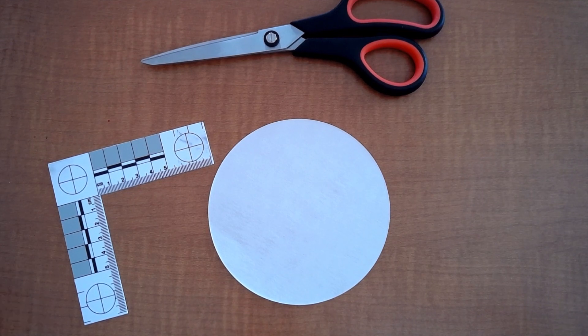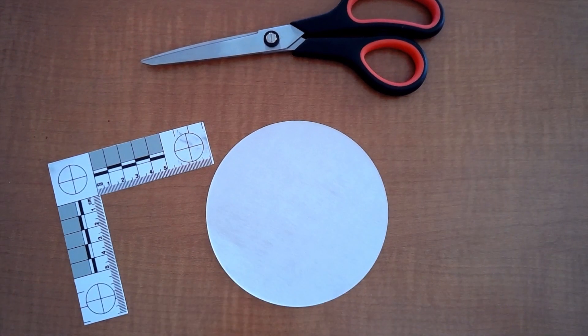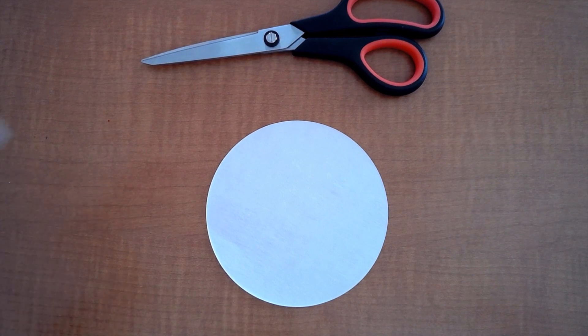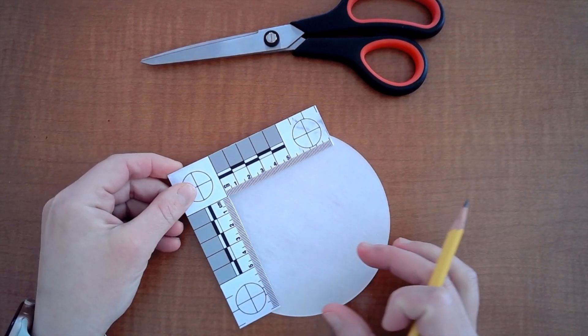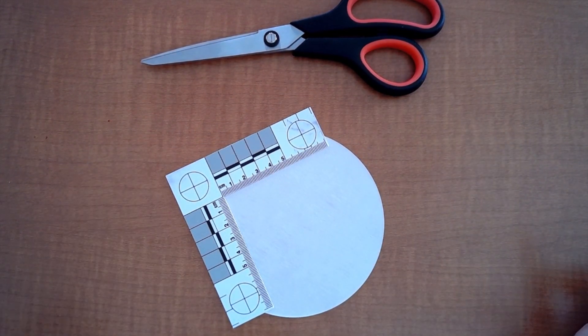But we first need to get our paper ready. So in order for it to fit in our beaker we need to cut it to the right size and it just so happens that your L-shaped ruler is perfect for this job. We are going to make an eight centimeter by eight centimeter square.